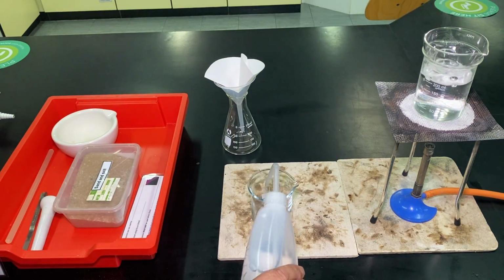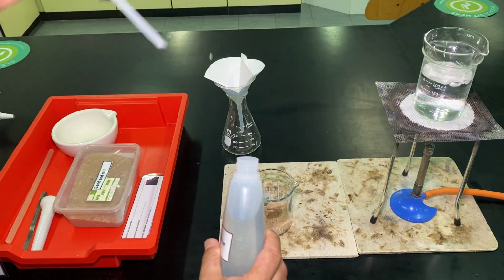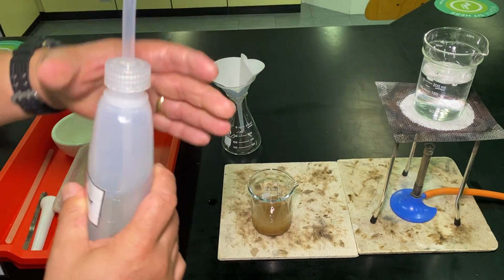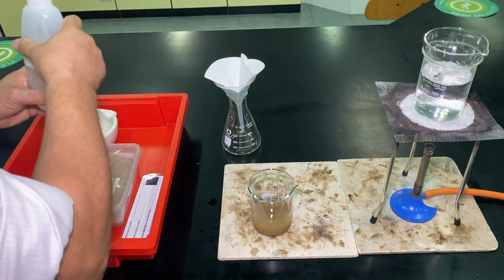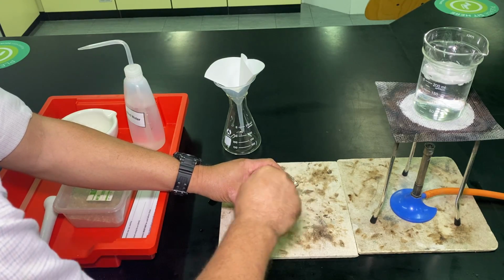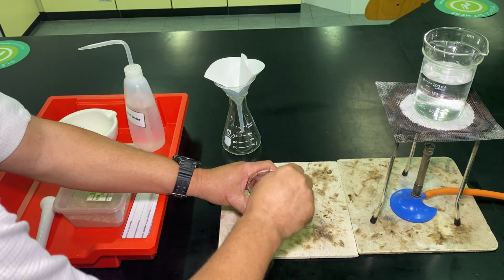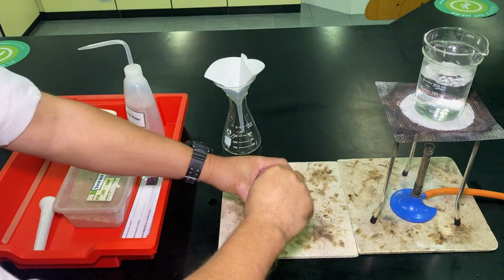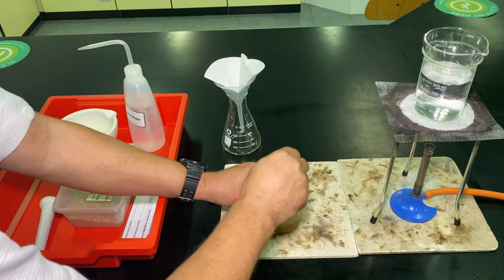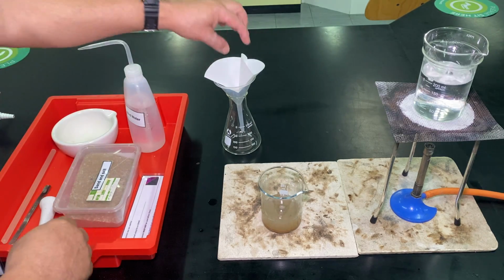Right, so we're then going to pour in the distilled water. I think it's a little quicker if we do it that way. And then it's a case of dissolving the crushed salt. So give that a really good stir, and then hopefully we can get the crushed sodium chloride crystals dissolved into the distilled water. And then it's filtration.